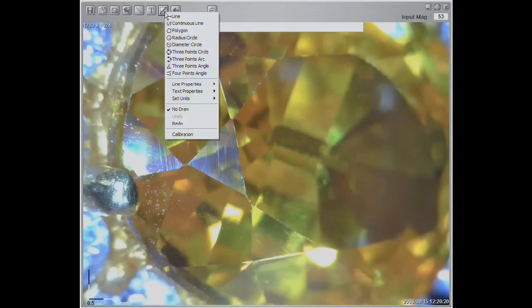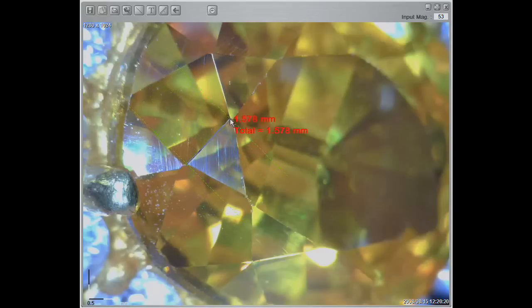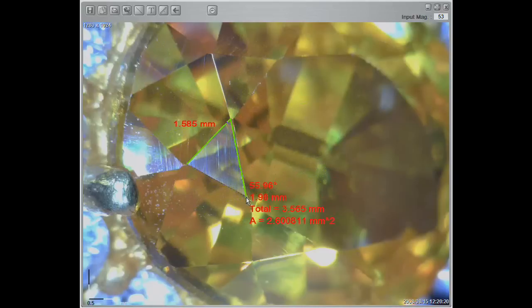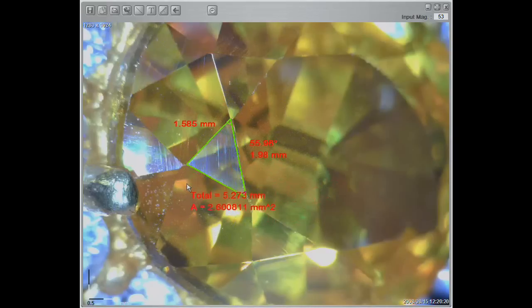Select the polygon option in the measurement menu. I am going to draw a triangle for my example. Start measuring by left clicking at the starting point, click again to finish the first segment, and place the results. Continue measuring the next side of the polygon and place the results. Close the polygon to finish the measurements, place the last results, then select a place to put the total measurements.